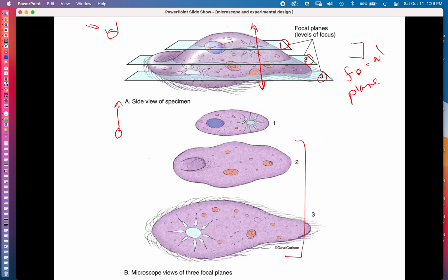What a confocal does is, by using the fluorescent dyes, it can avoid exciting these layers, not cause these layers to glow with those fluorescent pigments, glow red or green or blue. They don't glow at all until the microscope is focused on them. So we're just going to excite the molecules in this layer and get them to glow. And that removes the blurriness. There's no glowing blurriness that's out of focus.